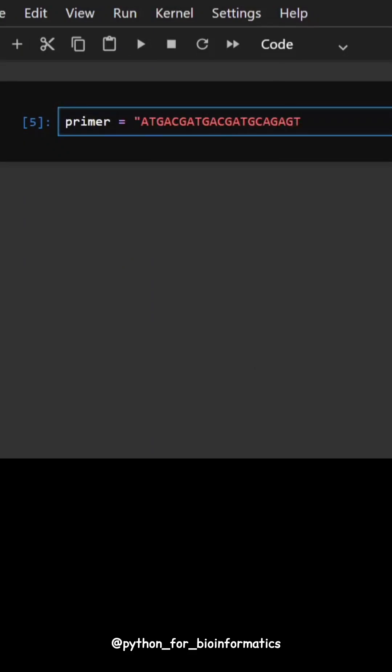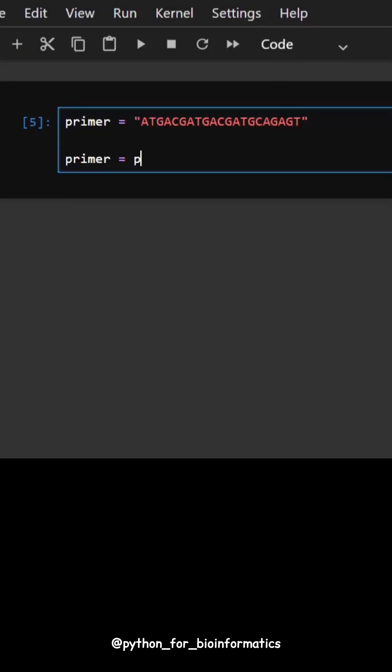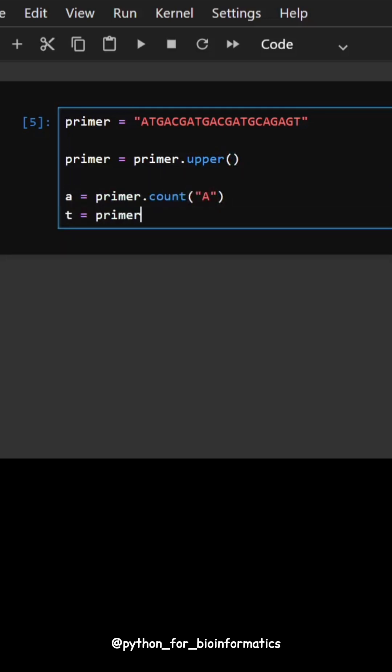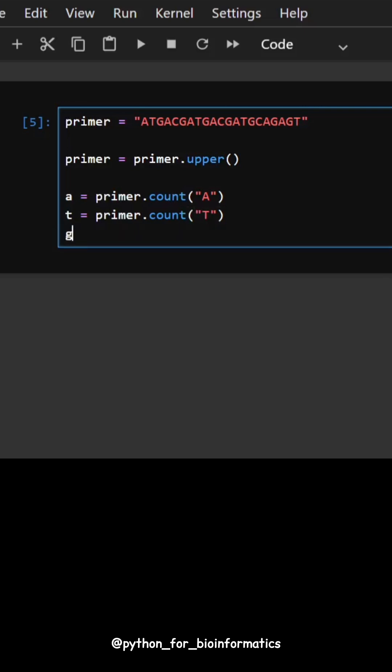Here's a quick Python code to calculate the melting temperature of a DNA primer. First we count the number of A, T, G and C bases.